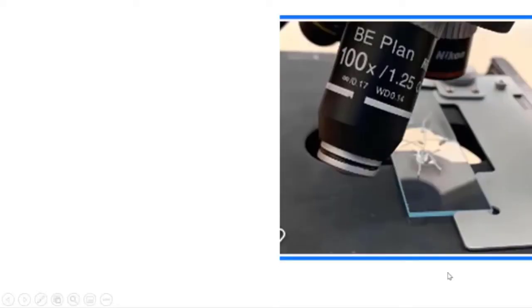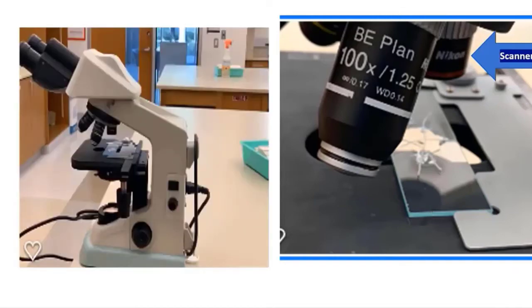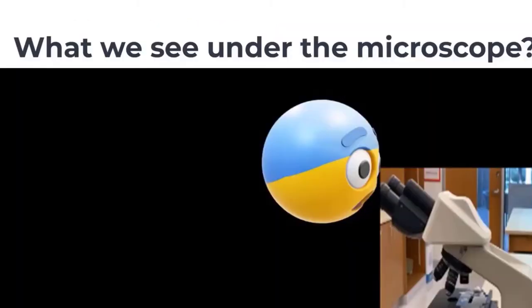Daphnia was placed in water in the depression slide and observed under the scanner objective lens of the compound microscope. So let's see what we see under the microscope. This is incredible and I hope you are as excited as we are.